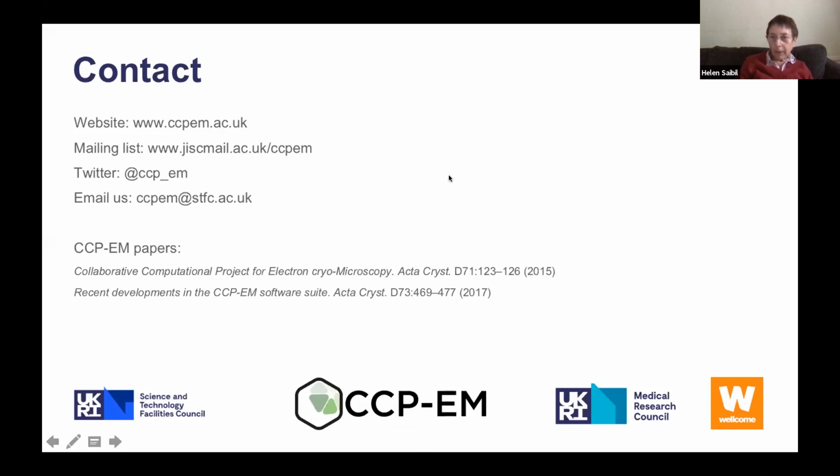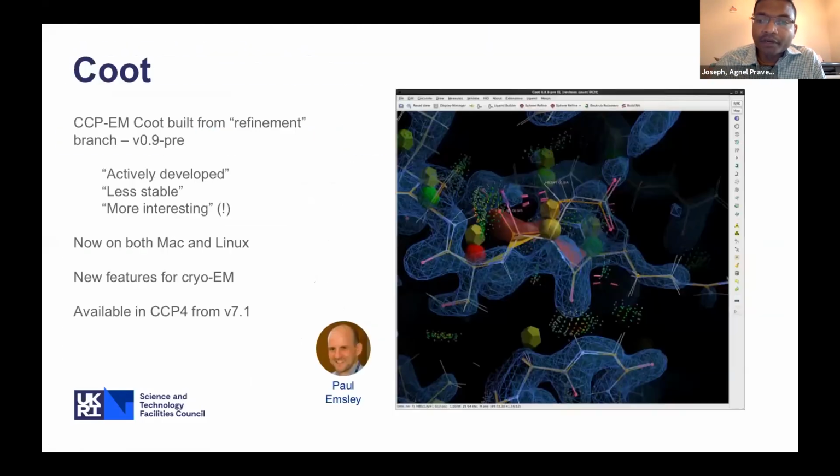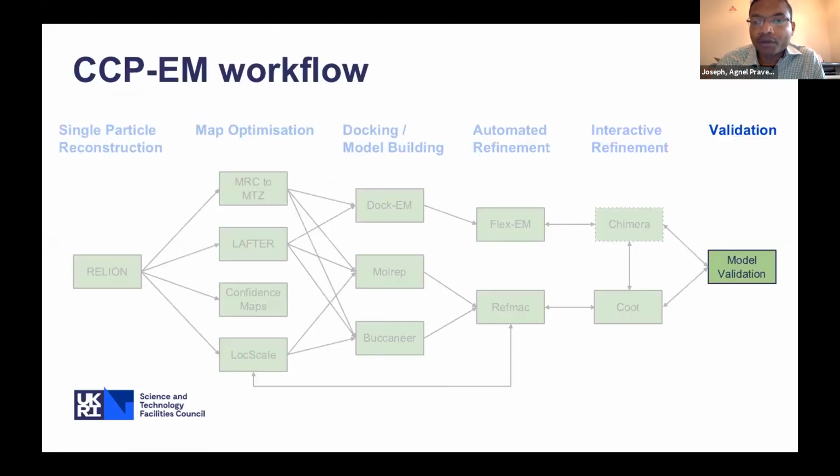Julien Bergeron has asked, CryoSPARC already implements variations of the map optimization software. Is it possible to jump straight into the docking and model building? Yes, most of the tasks that I explained here are independent, so you can straight away jump into different stages of this process.